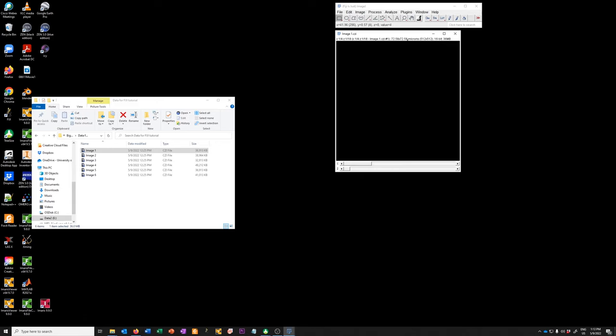Now we have multiple colors. In Composite Sum mode we can see how the different channels are overlaid. You'll quickly notice that things don't look very bright and are kind of hard to see. I'm going to switch back to grayscale where things can be a little simpler to see, and now we'll start discussing how to adjust the brightness and contrast.